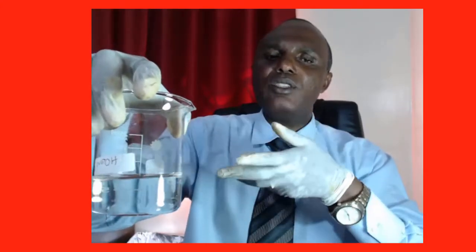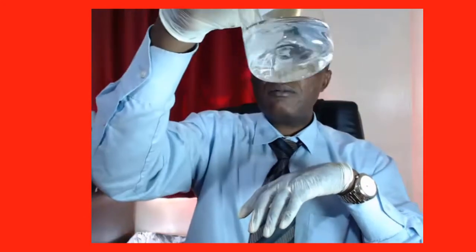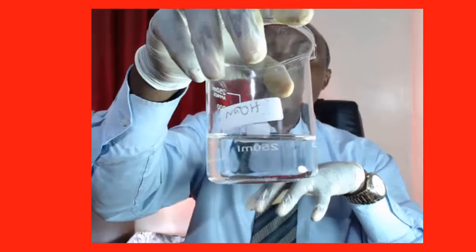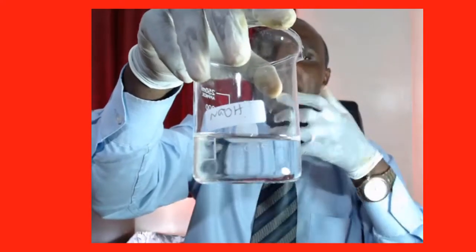We want to react those two solutions, and the objective of this titration will be to determine the concentration of this solution. The process of determining the concentration of an unknown solution is called standardization. You are standardizing. We are going to standardize the solution of sodium hydroxide.